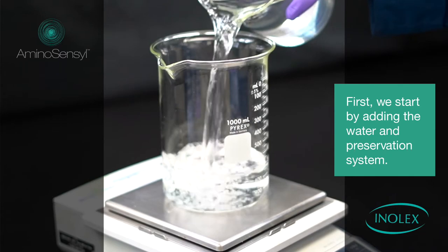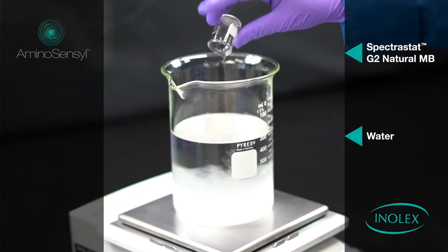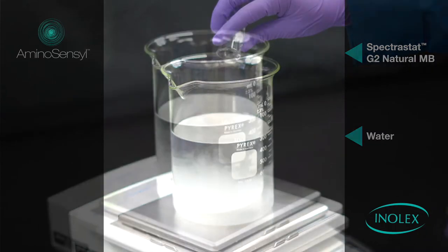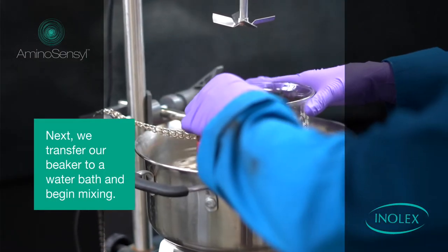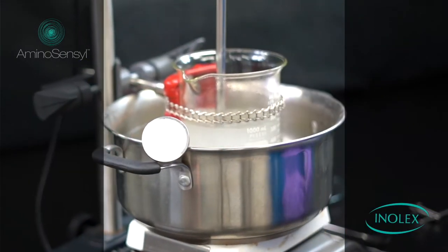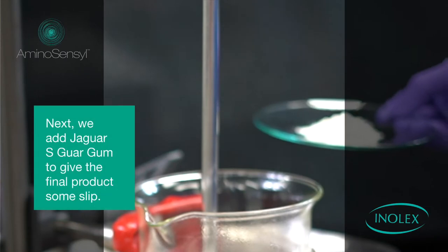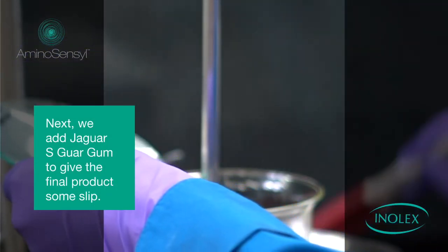First, we start by adding the water and preservation system. We are using Spectrastat G2 Natural MB. Next, we will transfer our beaker to a water bath and begin mixing. While mixing, we add Jaguar S Guar Gum to give the final product some slip.